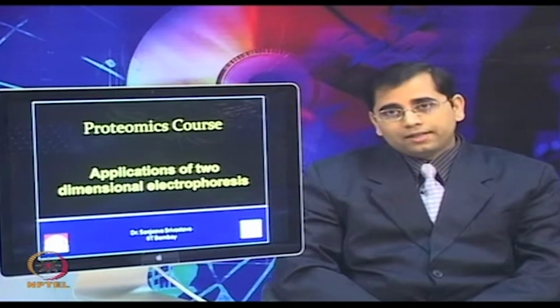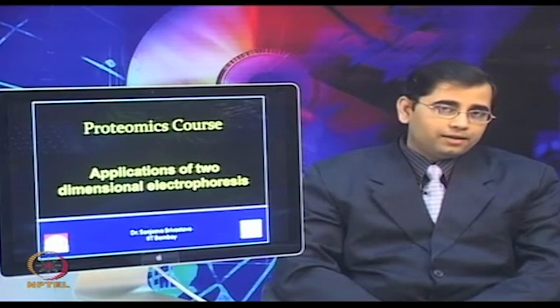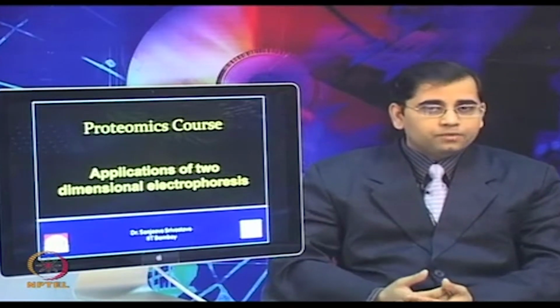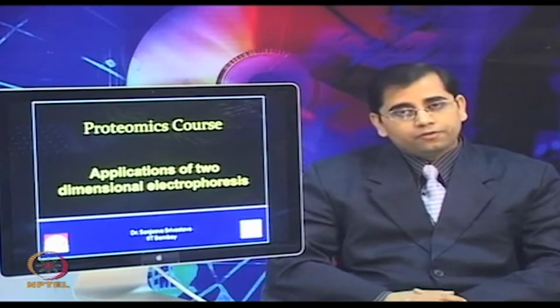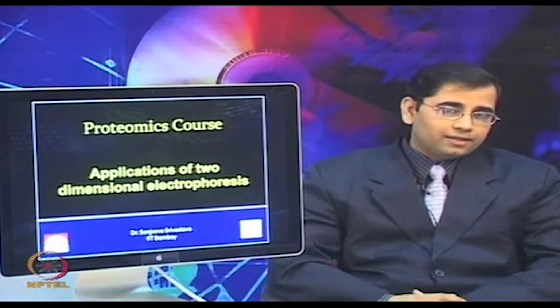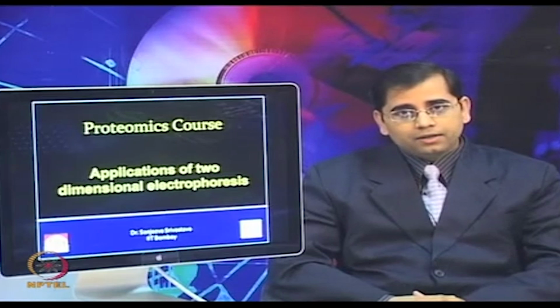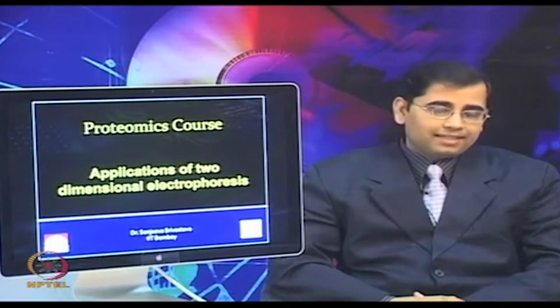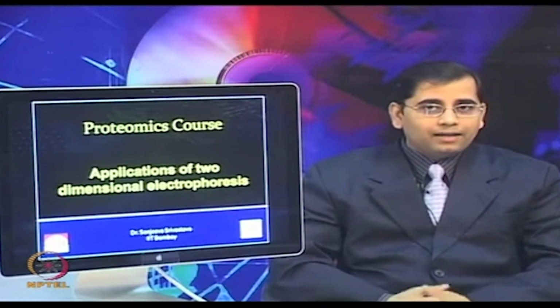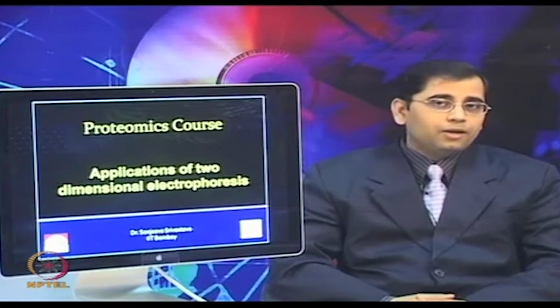Now, this is time for us to assimilate all the knowledge which we have acquired during the last several lectures. For example, what are the things one needs to take care of during protein extraction, then isoelectric focusing, second dimension protein separation, followed by gel analysis. So, all of this knowledge actually integrates when you want to apply these techniques in any biological applications.